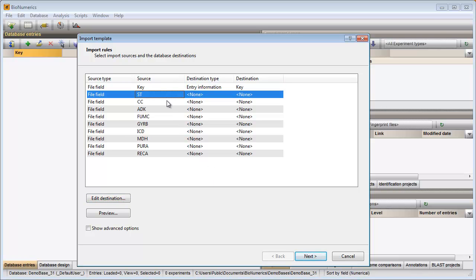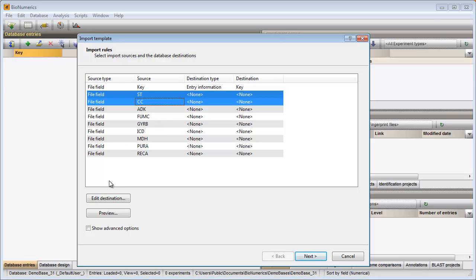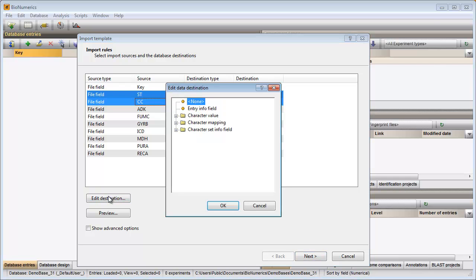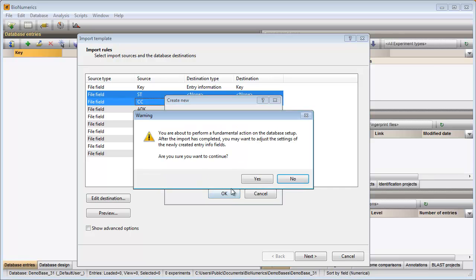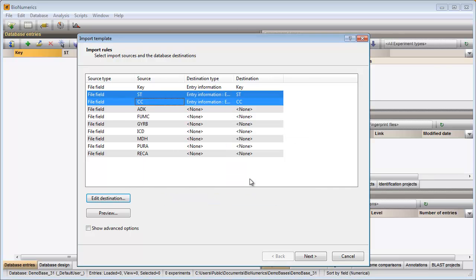With the Ctrl key I can select multiple rows in the grid. I then select Edit Destination and select Entry Info field from the list. I am prompted to give my fields a name. The column names that appear in my file are suggested but can be changed if desired. After confirmation the grid is updated.